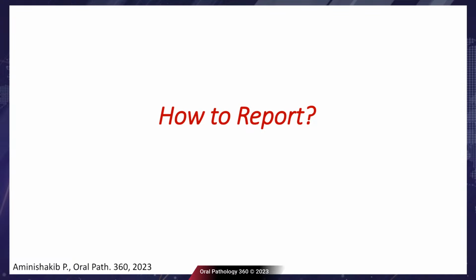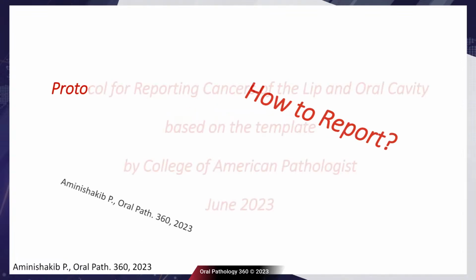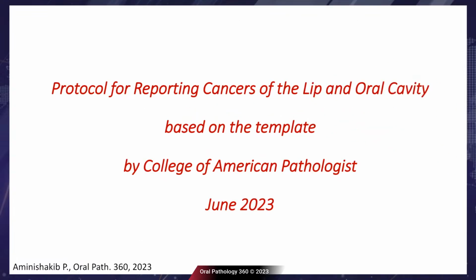Okay, then let's have a look at how we can report oral squamous cell carcinoma. We commonly use the protocol for reporting cancer of the lip and oral cavity, based on the template by the College of American Pathologists published in June 2023.